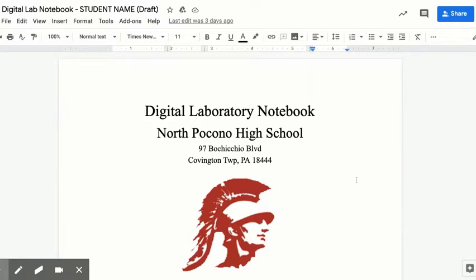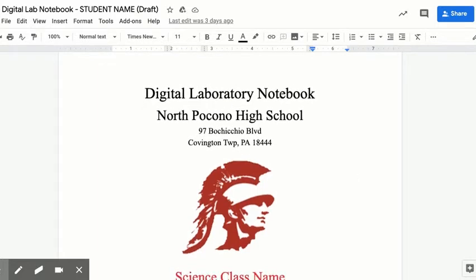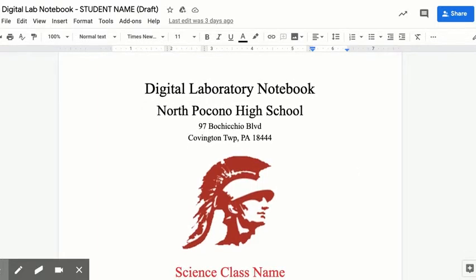This tutorial is to help show you how to use and input data into your digital laboratory notebook. This right here is the title page. Each student will be given a copy of this laboratory notebook to use this year to keep all of your lab data in.